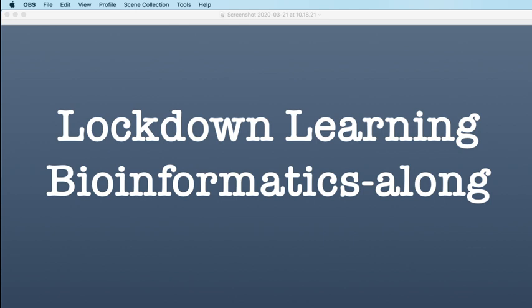So what we're going to do is start at the very beginning with some command line Linux, and along the way we're going to learn some skills and try to use those skills to analyze some real data. And I'm going to try and find a data set that's relevant to our current epidemic, so something to do with coronaviruses or similar to that.